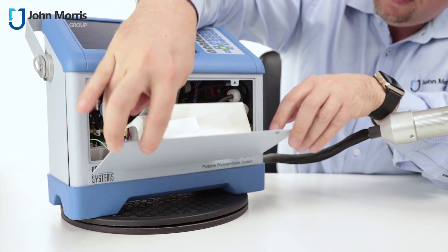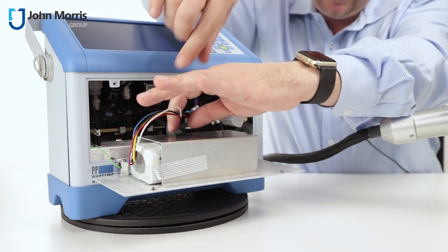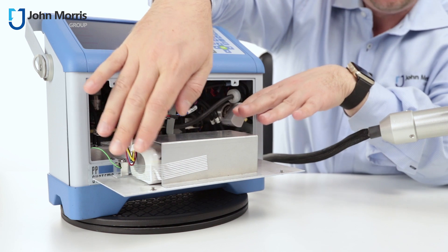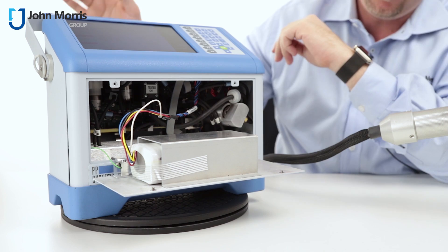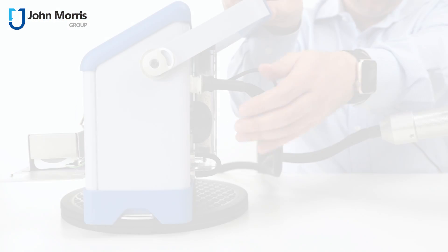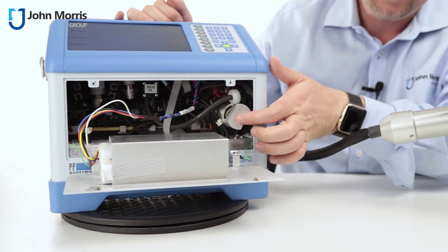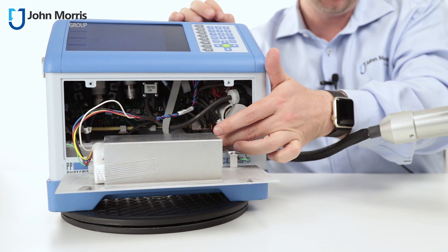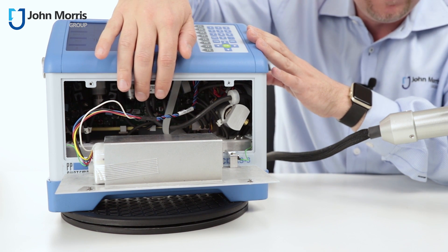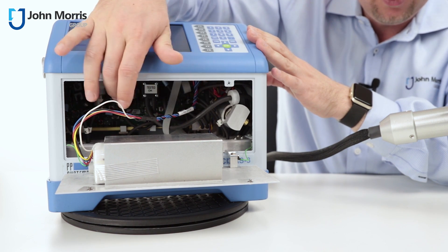So opening the front here, you can see inside the battery which comes with it. This is good for about eight hours. If you disconnect the clip here, there is also now available a 12-hour battery, which should see you through most of a day depending upon your sampling rates and how much daylight you get. The CO2 canister comes through here, and you can see the front of it hidden just behind here. Inside in this temperature control block are four infrared gas analyzers. And that constant hum you can hear throughout this video is the pumps clicking and whirring away up here on the top.